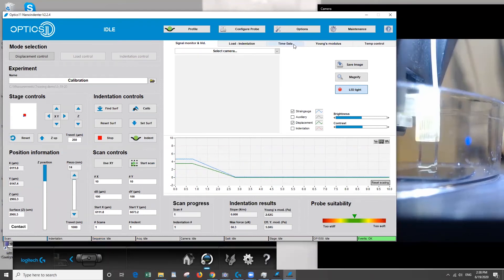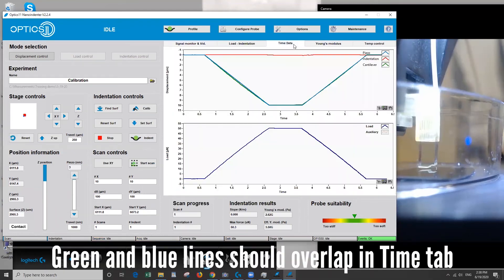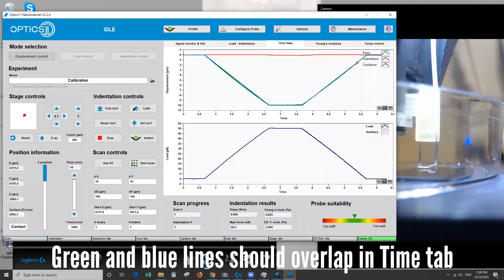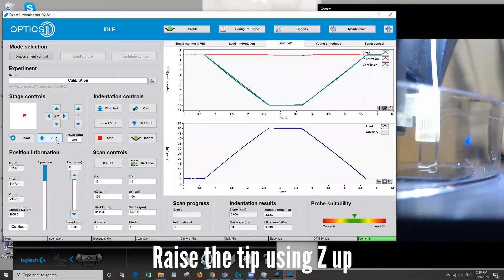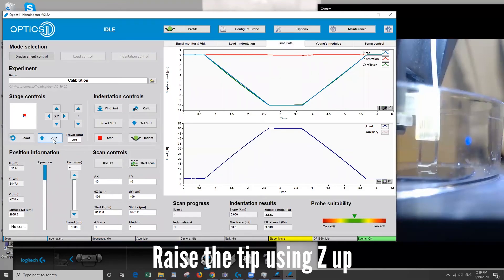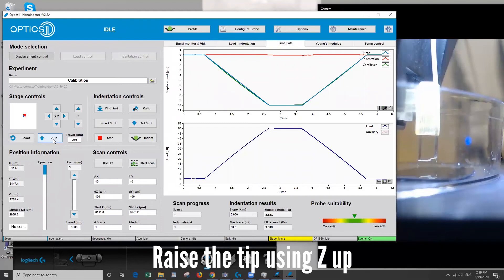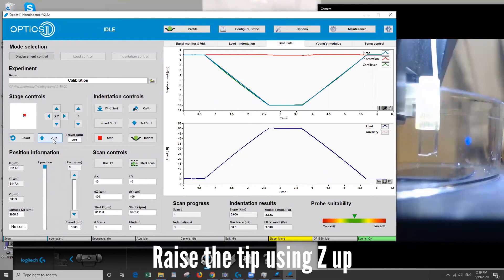Okay so here the green and blue lines correspond to the cantilever bending and probe displacement. We want to make sure they have a nice overlap and they look pretty good so the calibration is done. What we want to do now is bring the tip back up to its zero position. So we'll click z up. And this allows us to get ready to measure our sample. So the calibrations are quick and easy and they're already done.